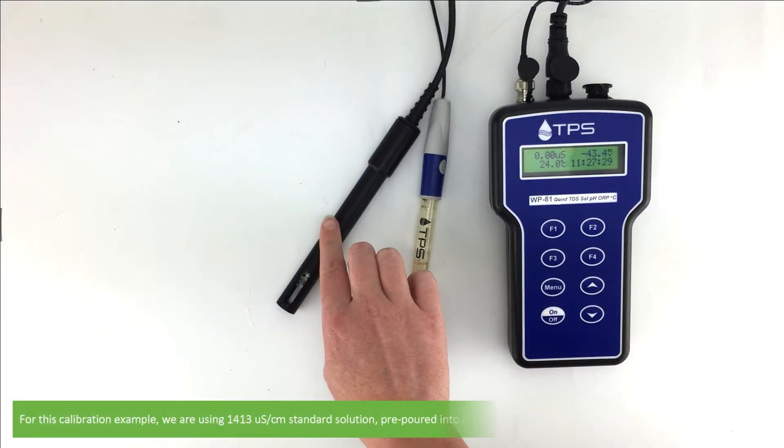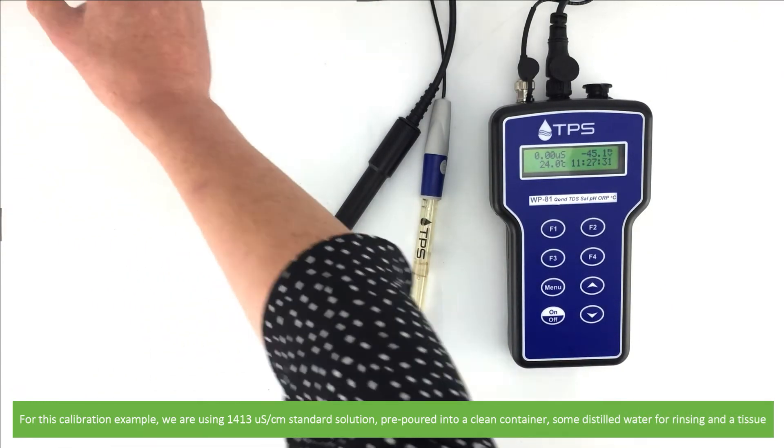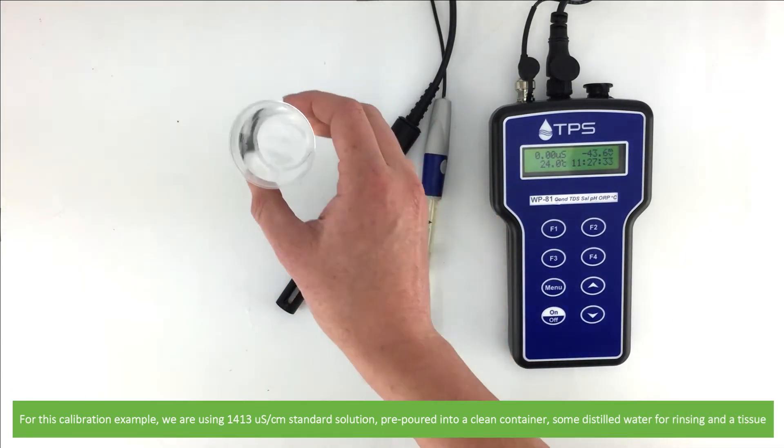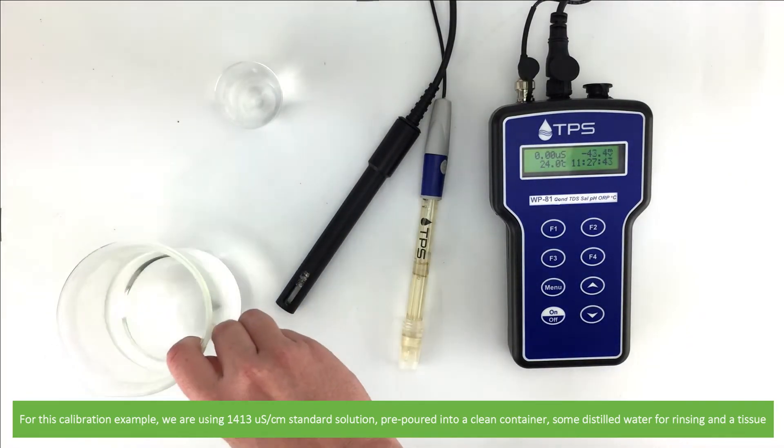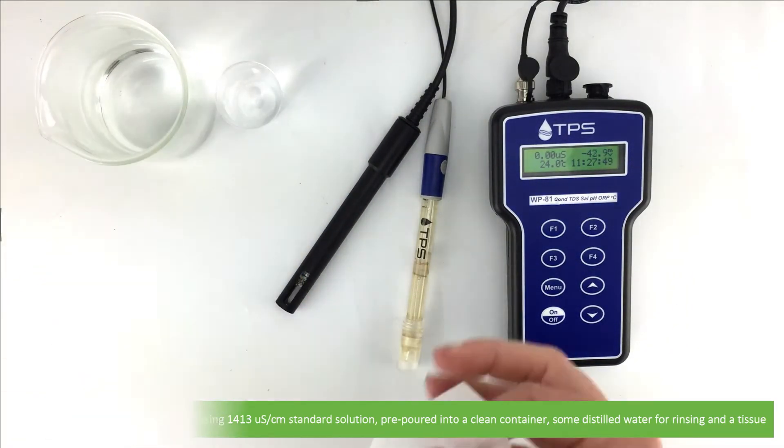For this example we are using 1413 microsiemens per centimeter standard solution pre-poured into a clean container, some distilled water for rinsing, and a tissue.